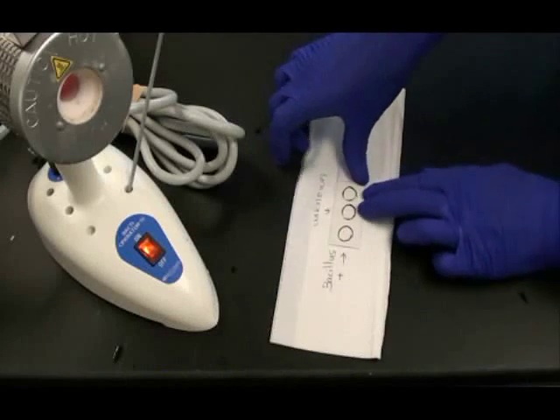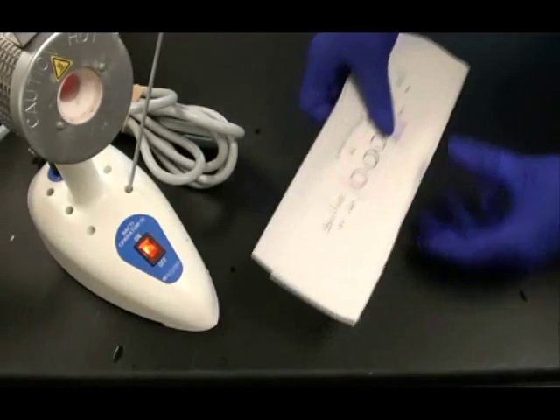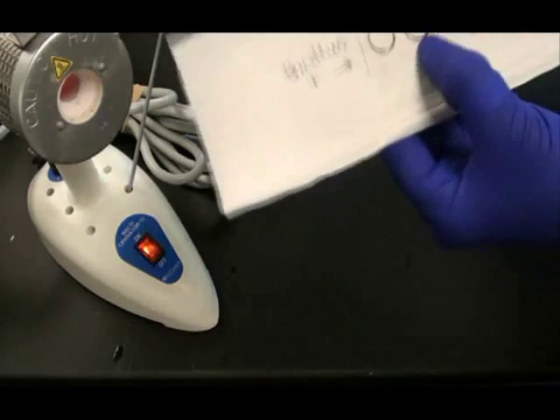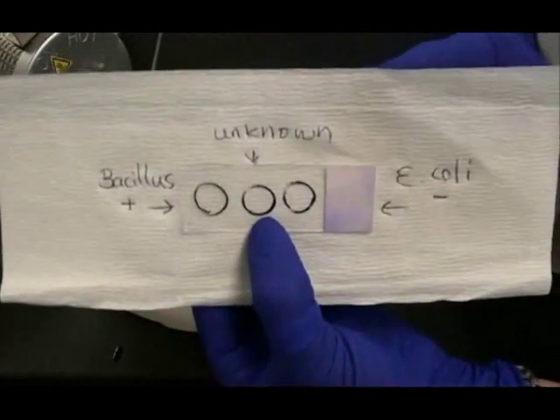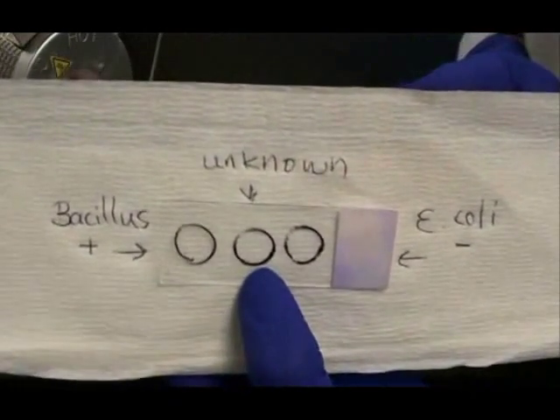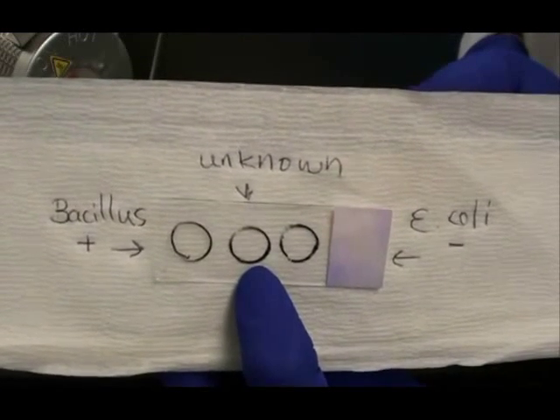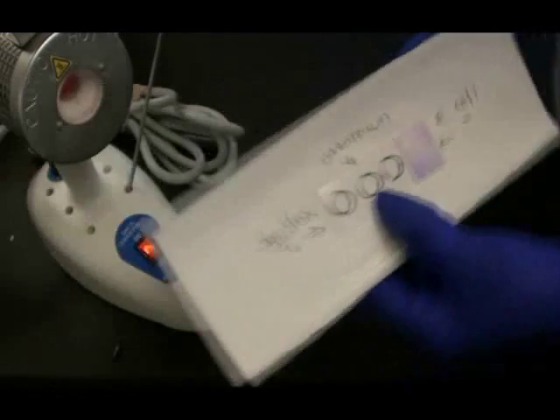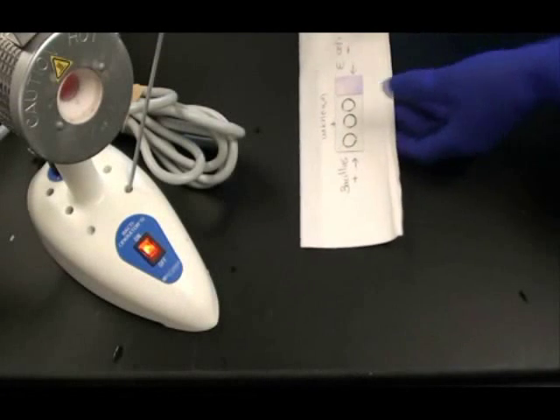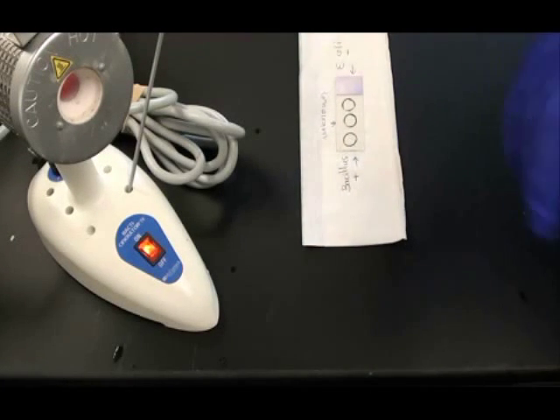You may want to label a paper towel with the names of the samples that you'll be putting onto your slide. I'm going to put Bacillus, an endospore producer on the left. E. coli, a non-endospore producer on the right. And my unknown in the center.